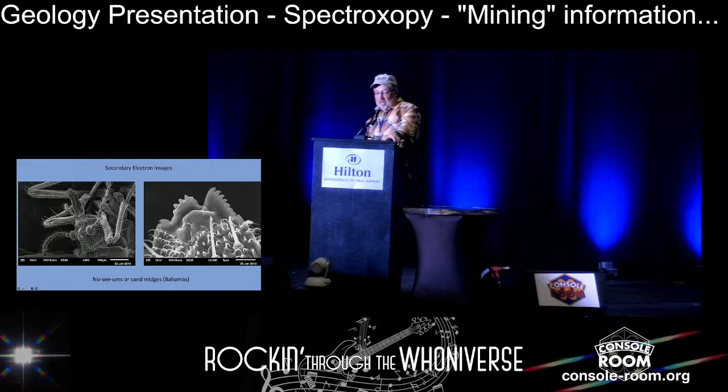The picture on the left shows one that's kind of desiccated. You probably can't see the detail, but the eyeballs have collapsed, and the thing has actually shrunk down because of all the fluids that were removed. But you can see the proboscis here. There are 2 little tubes that are used to inject the victim with an anticoagulant, and then they basically slurp up the soup. So this right there, that's about 5 microns across. That's what they use to slice you.